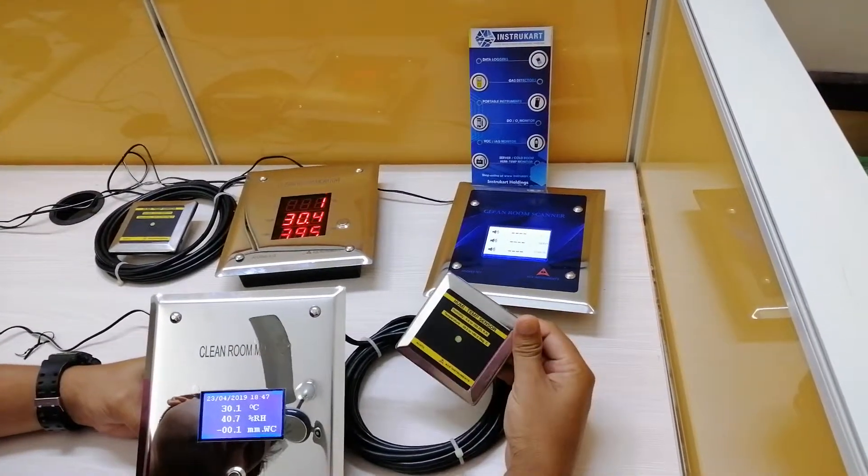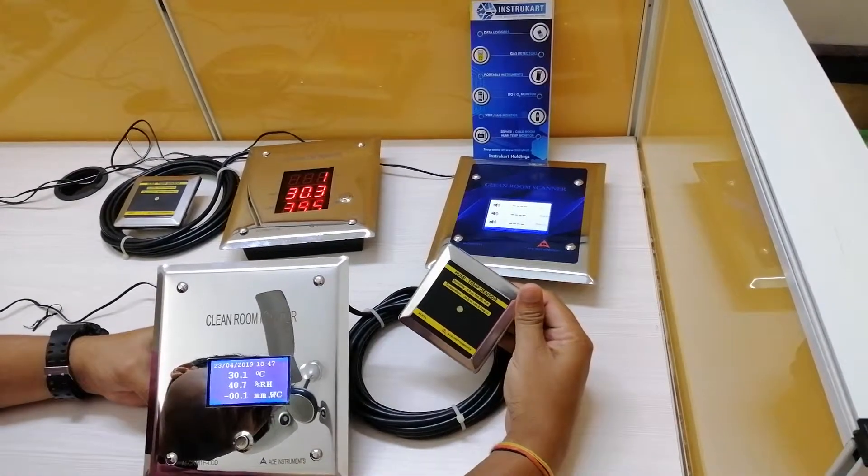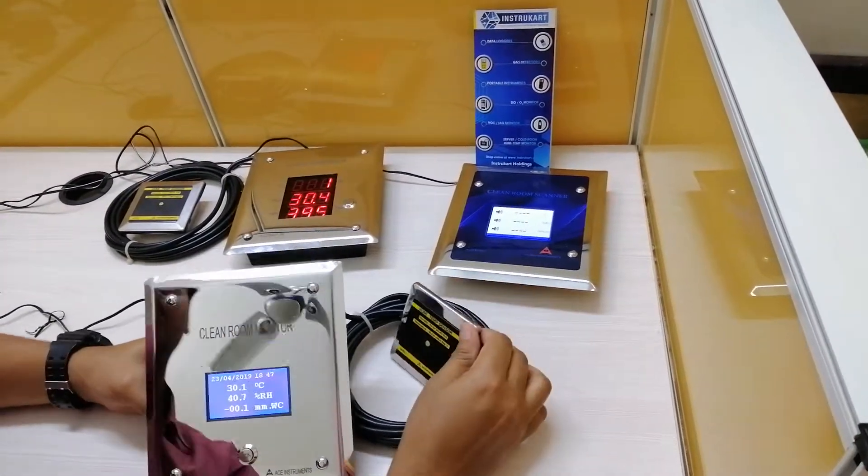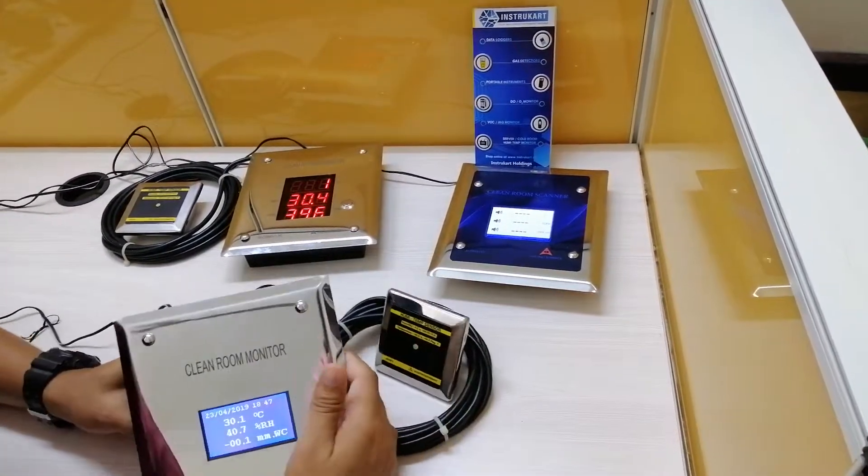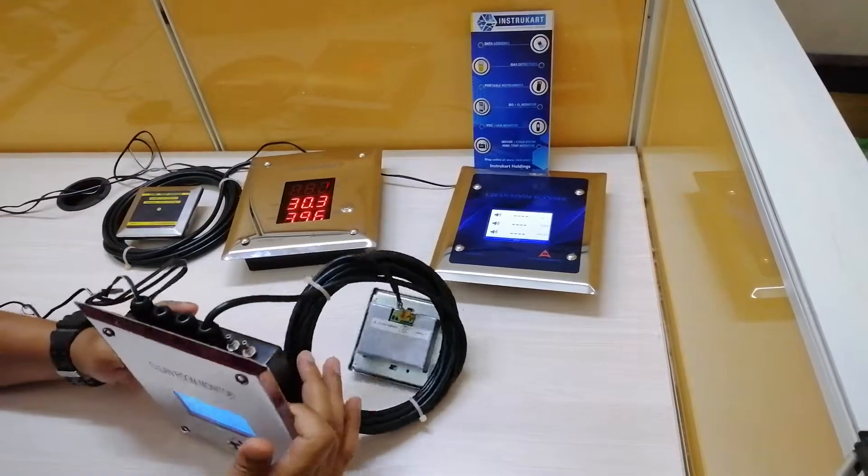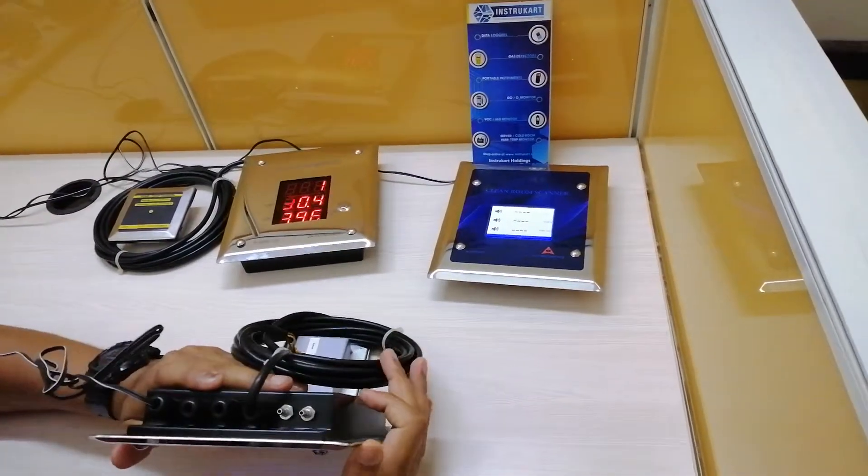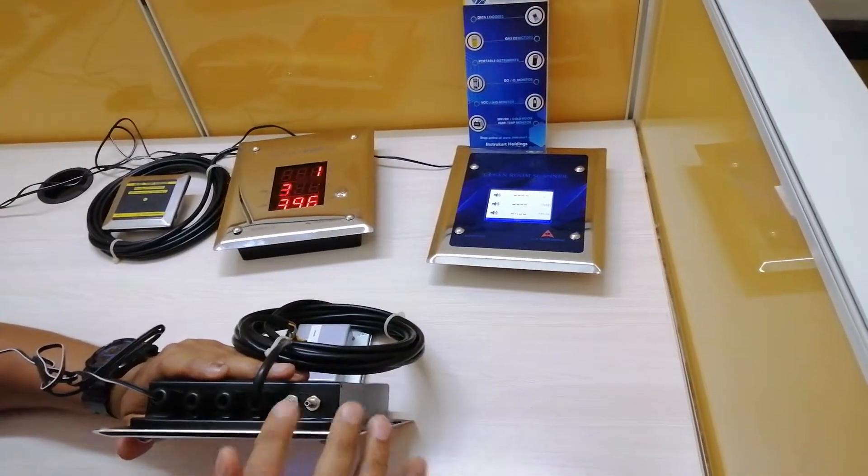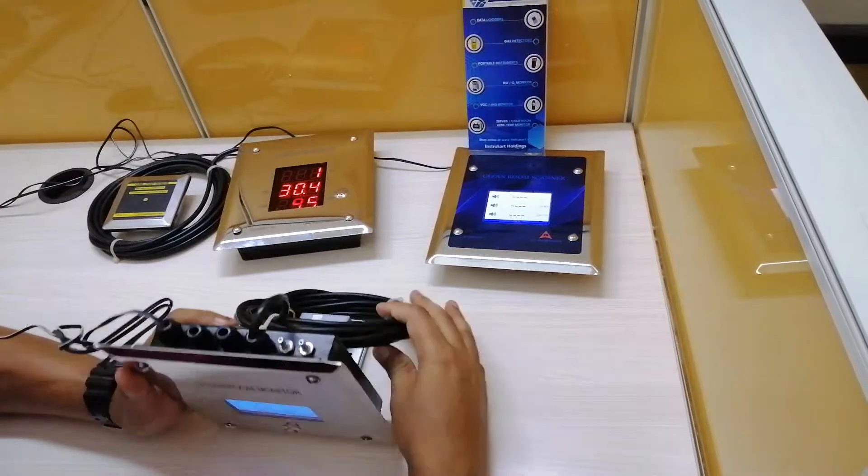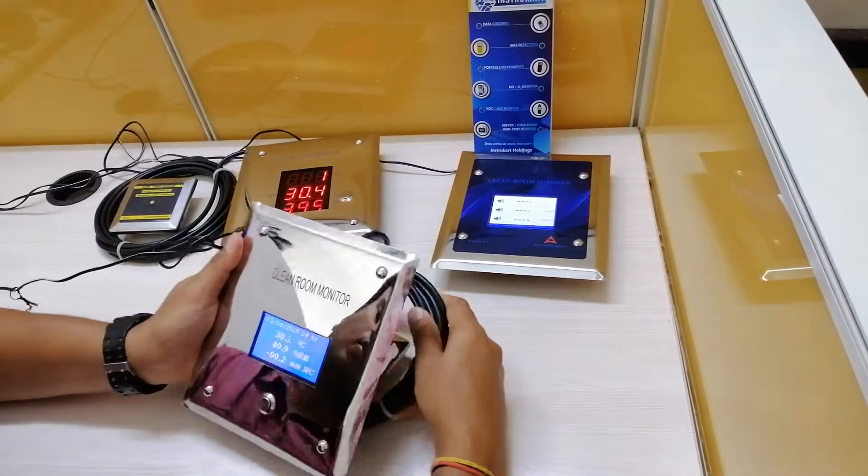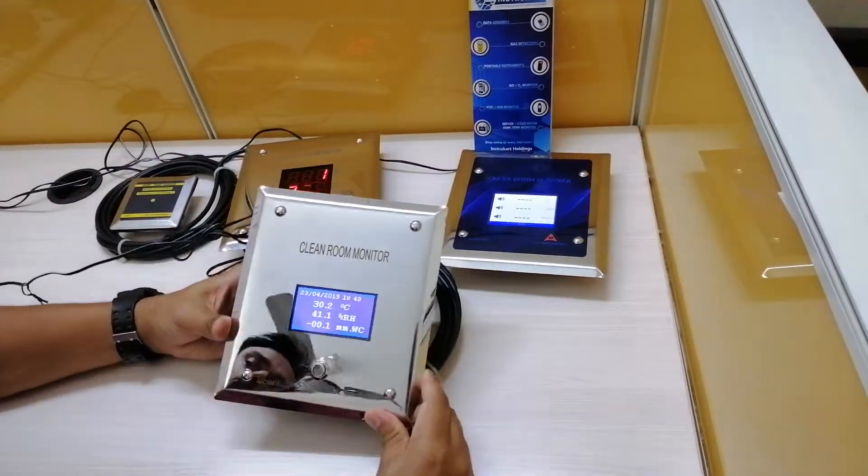These are the humidity temperature sensor and the differential pressure sensor. Now let me tell you the specifications.